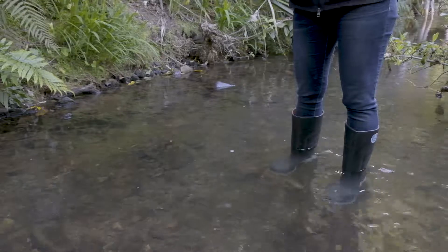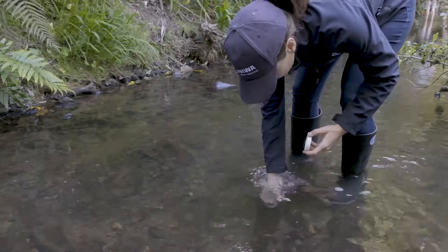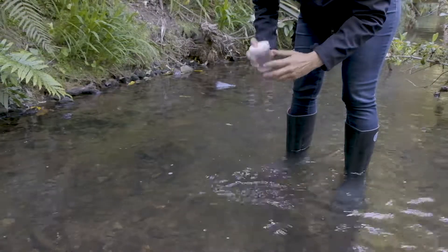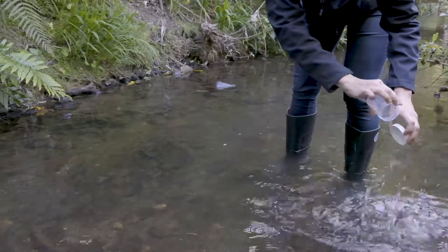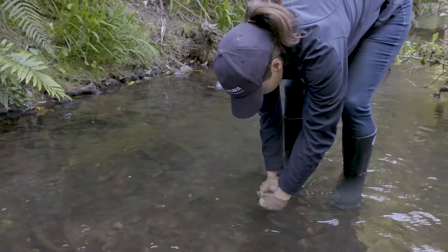Clean your container by tipping it upside down and pushing it down well below the water surface. Then turn it upright so it fills. Tip that water out. Rinse the lid too. Repeat again, but keep the water this time.